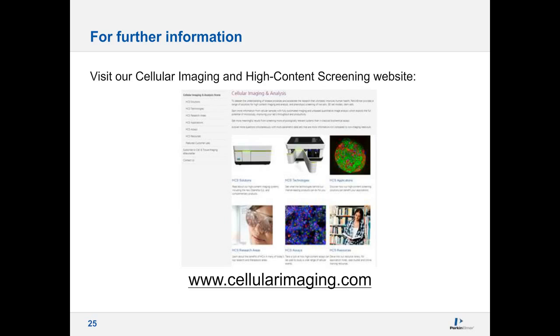When it comes to bright field imaging, in that case, the answer is we do have a single wavelength bright field source, which has been selected to really maintain cells healthy and alive and to minimize the light exposure of the cells, which is not well suited for colorimetric assays, for example, like H&E stains.